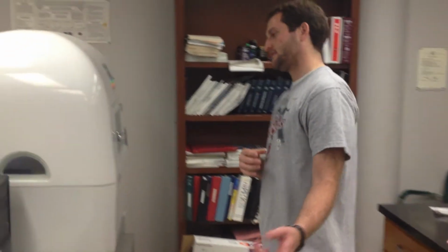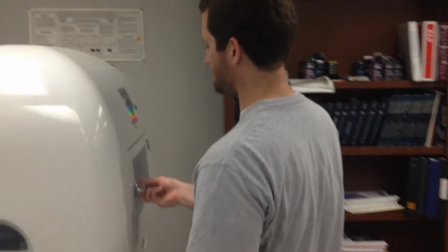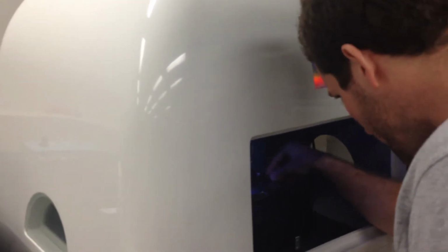Okay, so we've done 2 of the 3 calibrations that we need in order to use the machine. The last one is what's called the probe calibration, and that's where we actually calculate the area function of the pyramid indenter that we're using. And we do that by making indents again, like we did on the aluminum sample, where we use a standard sample of fused quartz.